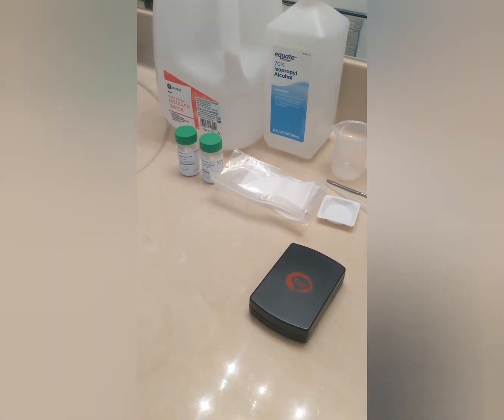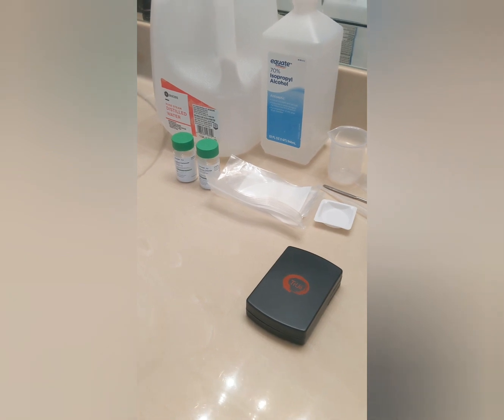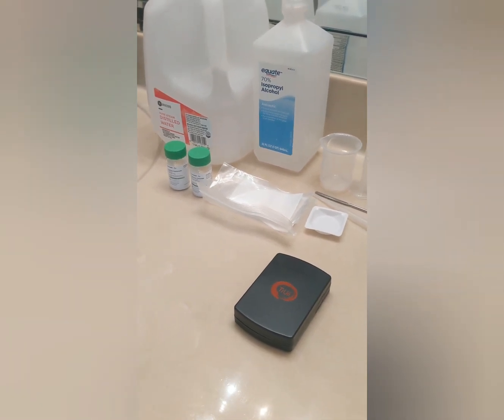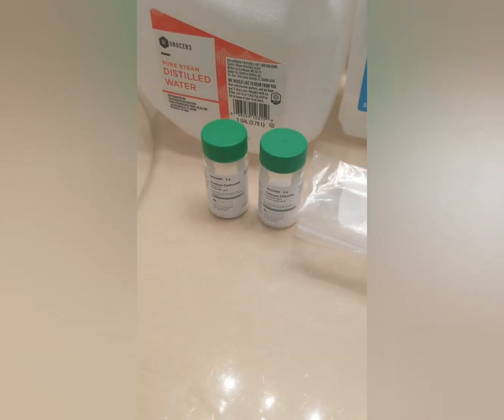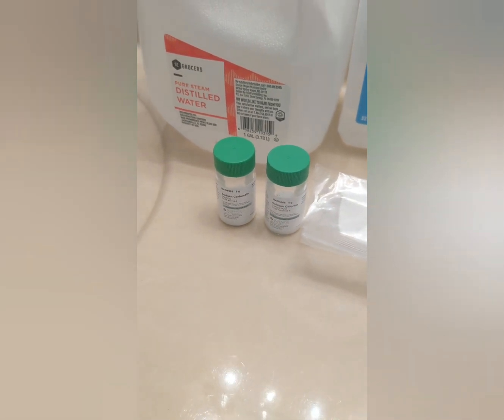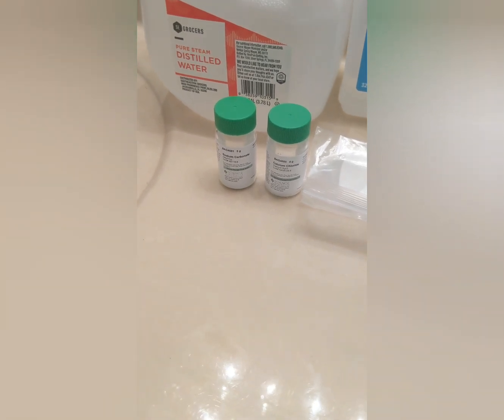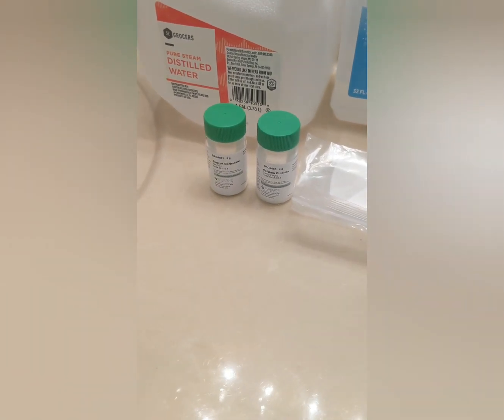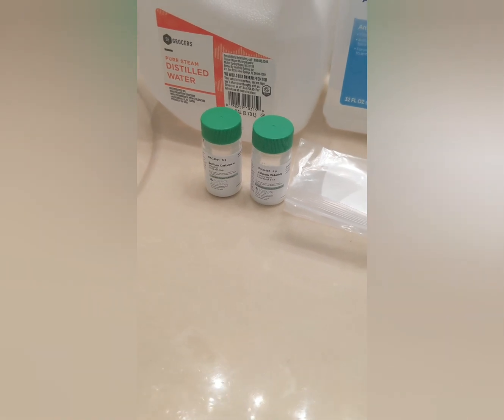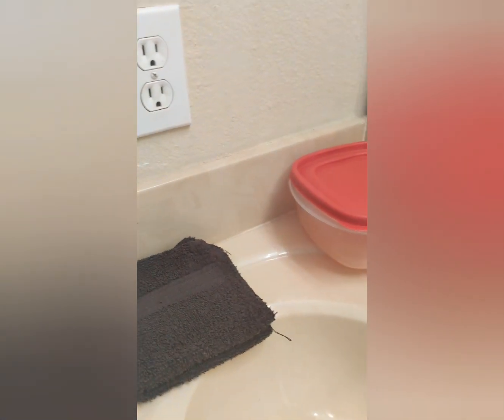As previously mentioned, I will be facilitating a double displacement reaction in this lab using filtration methods. We will be working with sodium carbonate and calcium chloride. Both of these substances can be irritants, so I am wearing protective gloves and protective lab gear as well as safety goggles. For spill measures, I have paper towels and a regular towel.